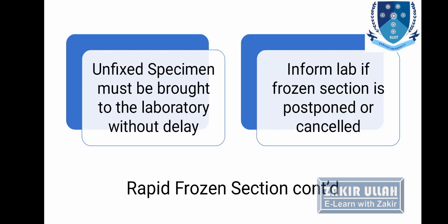Then when it is suitable for a doctor or a surgeon, he can go further as per the investigations of the lab. If a doctor thinks that there is no need for rapid frozen section, he should inform the lab staff in time, so that they can carry on their routine work, because rapid frozen section is an emergency procedure. Therefore, the doctor should inform the lab staff that he has postponed or cancelled the rapid frozen procedure. Therefore, lab staff should be informed in a timely manner.